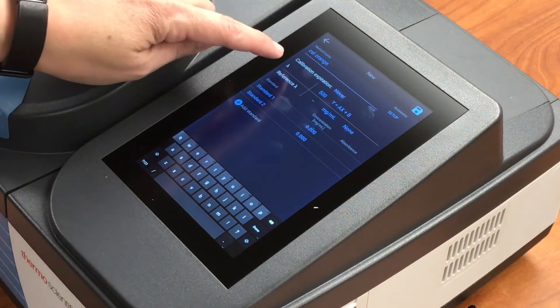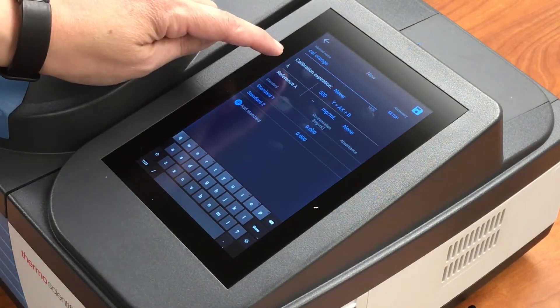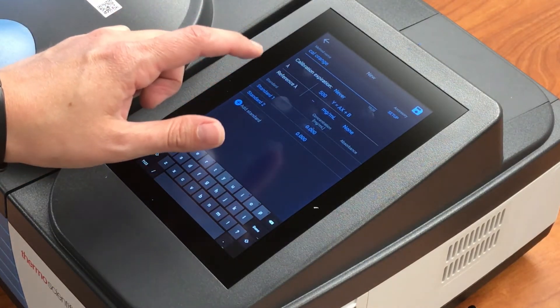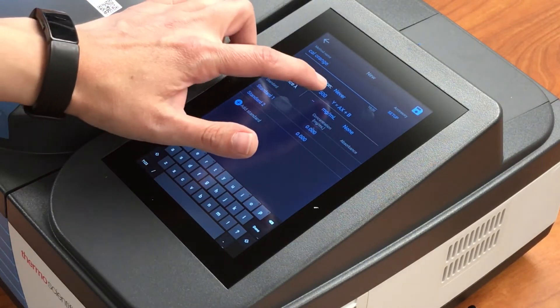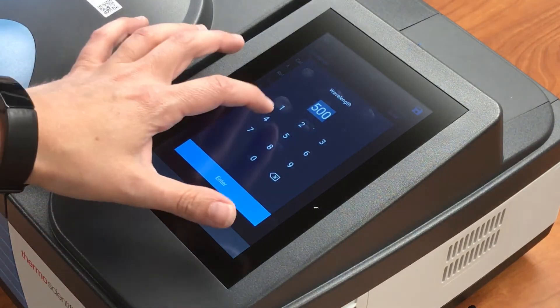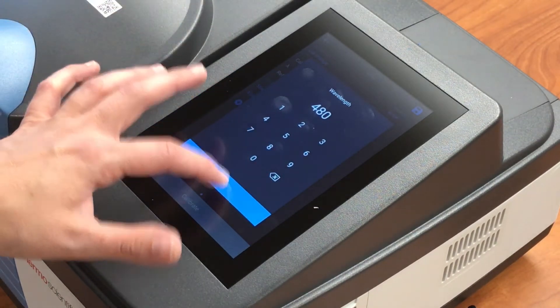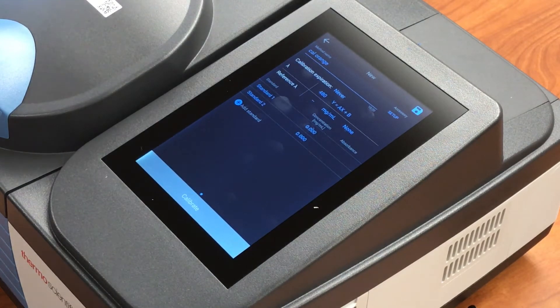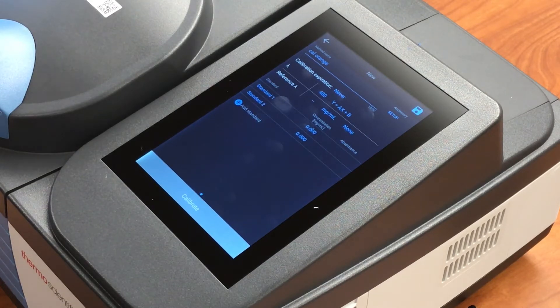Then, where we see the lambda, this is where we can select the wavelength of interest. Our orange solution has a wavelength maximum of 480 nanometers, so I'm going to input that for the wavelength that we're going to collect the absorption at for each of our samples, or each of our standards.